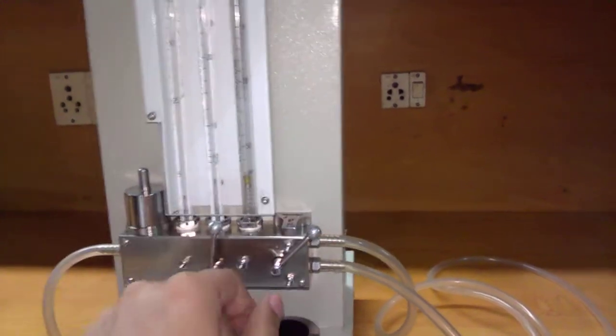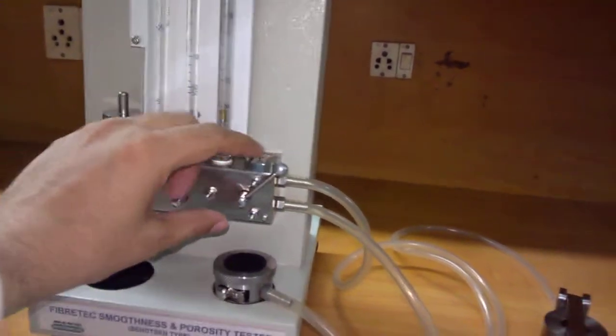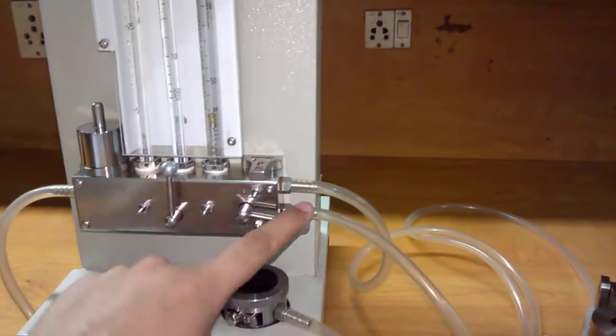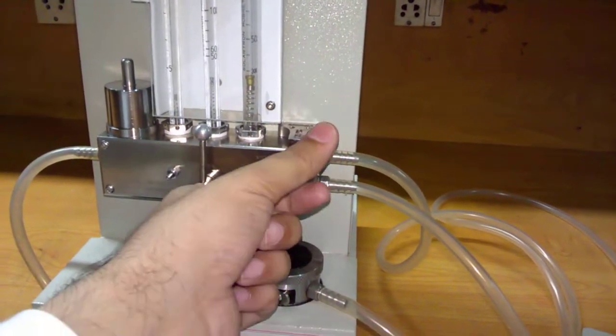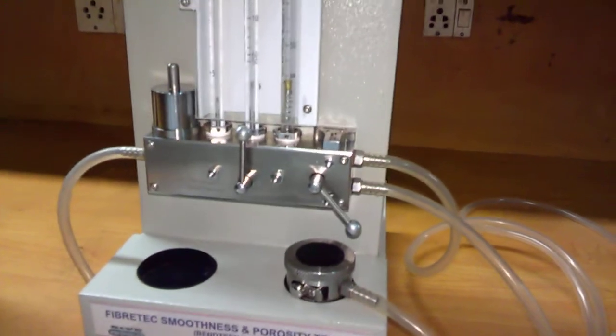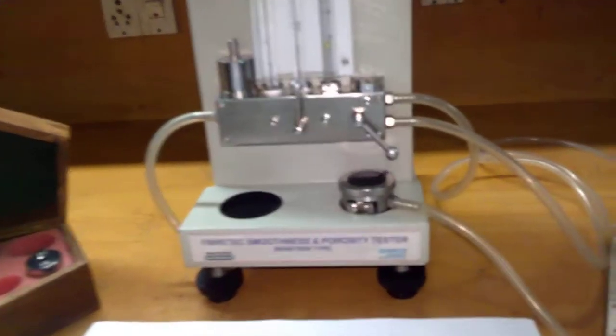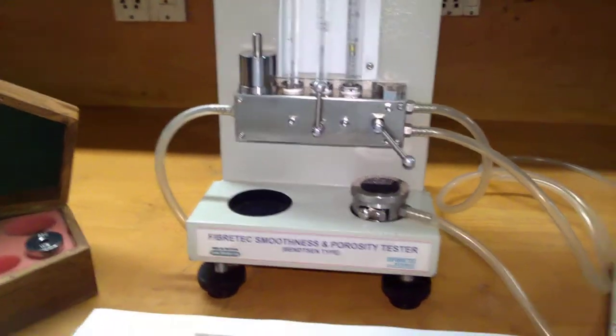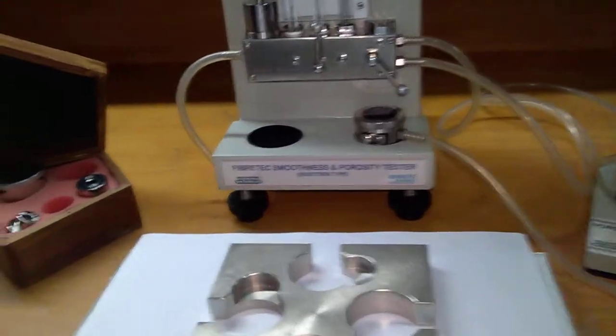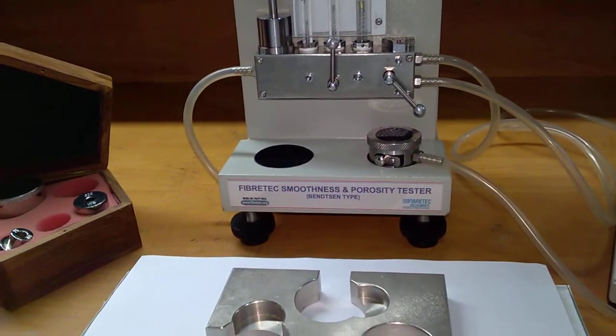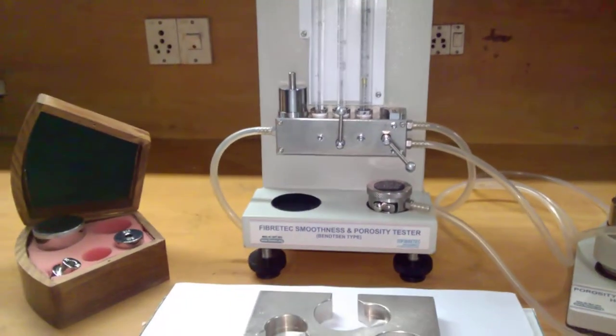At this moment we have set it to the middle position. This is enough to select smoothness at the top position and porosity at the bottom, downward position. We can level the equipment by these feet screws, and after inserting the air at required pressure, we can start the testing.